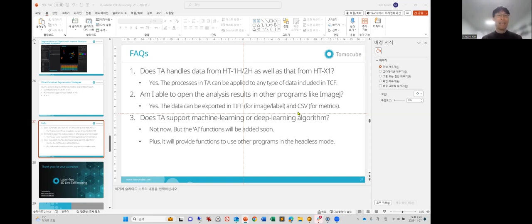In living cells the RI value of the nucleus is lower than the cytoplasm, so it's like a void in the middle of the cell in terms of holotomographic data. We've tried many ways to segment the nucleus and nucleoli, but have not yet been successful. That's the painful part for us.